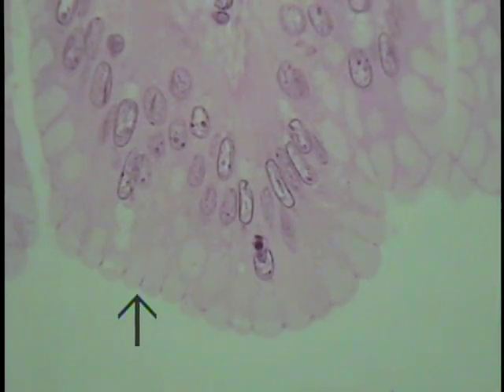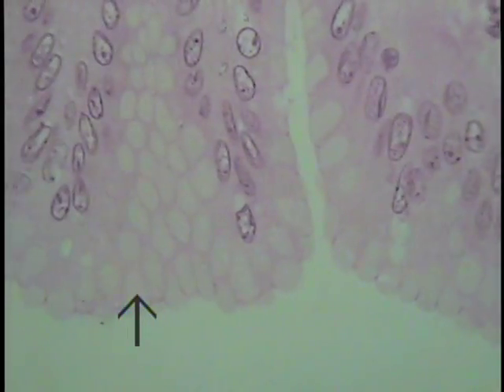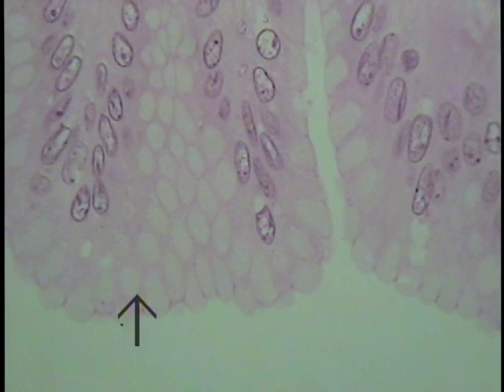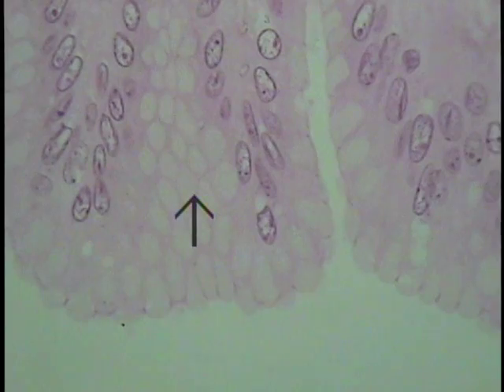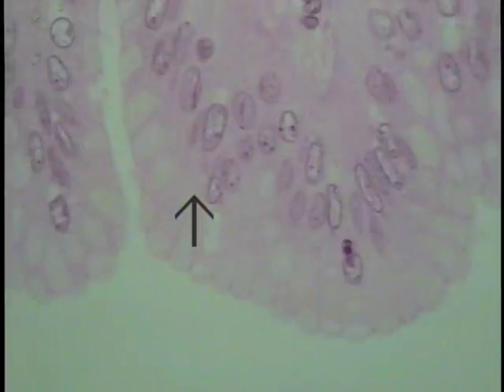Another feature that should be demonstrated to you is when you encounter a field such as this. If one can envision, these are the apices of several cells as if you were looking down on them from the superior level.